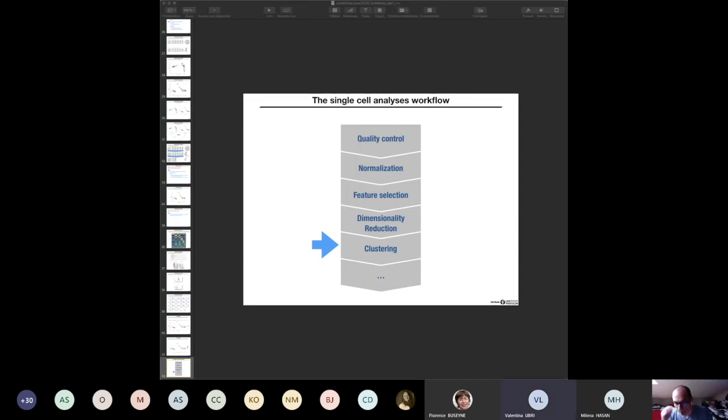There were some questions in the chat. There's one question Bent answered, but maybe we can share with everybody. It was from Freddie: I was wondering why cells with high mitochondrial gene expression are problematic.